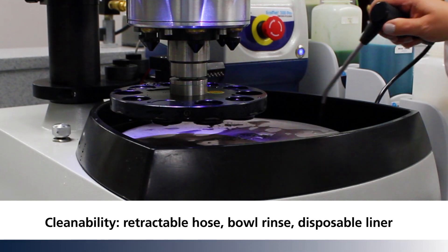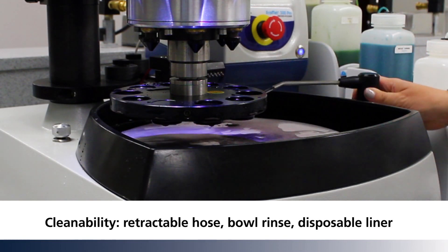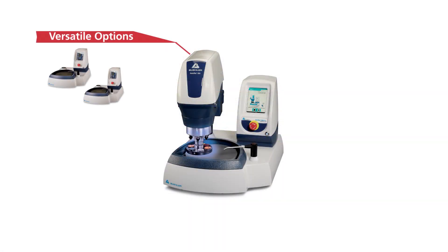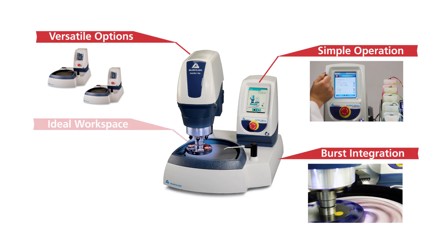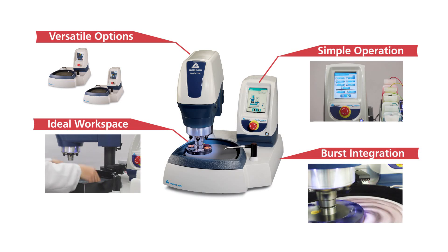Cleaning is simplified with the retractable water hose and integrated bowl rinse. Versatile options, simple operation, seamless BURST integration — an ideal workspace that is well-lit and easy to clean.